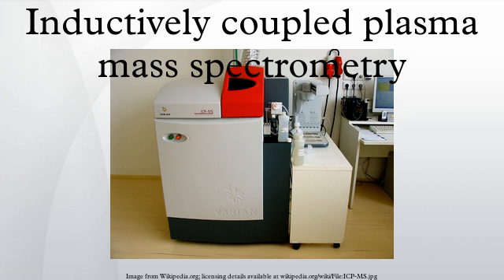Elemental analysis. The ICP-MS allows determination of elements with atomic mass ranges 7 to 250. This encompasses lithium to U. Some masses are prohibited, such as 40, due to the abundance of argon in the sample. Other blocked regions may include mass 80, and mass 56, the latter of which greatly hinders Fe analysis unless the instrumentation is fitted with a reaction chamber.